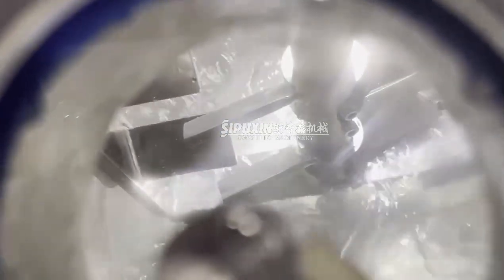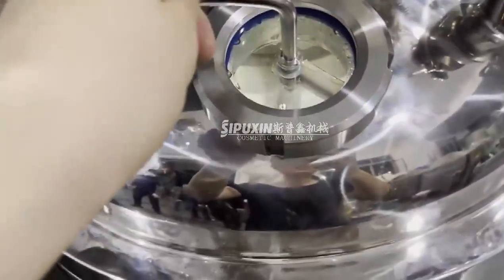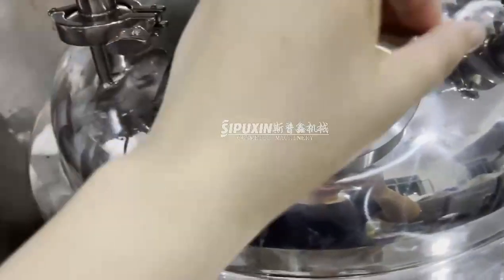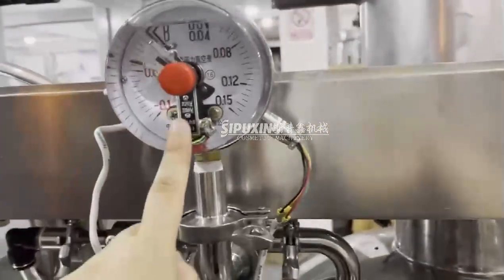You can see inside the home organizer working, and this side glass can help you watch and observe the reaction inside. This is the vacuum pressure gauge.